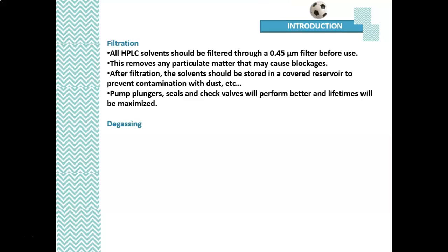All HPLC solvent should be filtered through a 0.45 micrometer filter before use, and this will remove any particulate matter that may cause blockage inside the column. After filtration, the solvent should be stored in a covered reservoir to prevent contamination with dust. Pump plungers, seals, and check valves will perform better and their lifetime will be maximized.